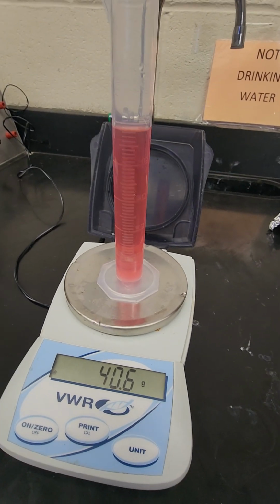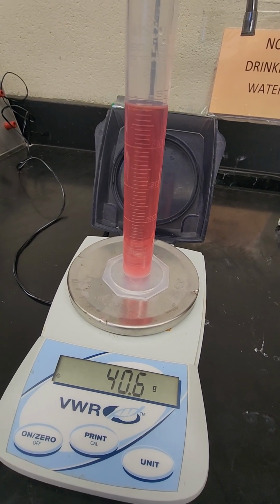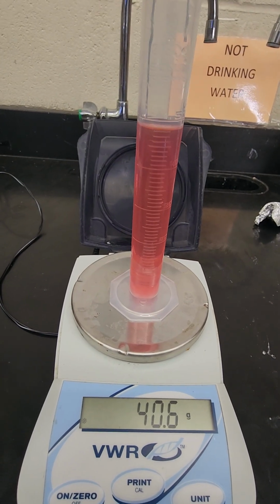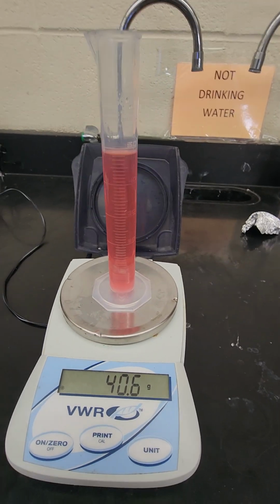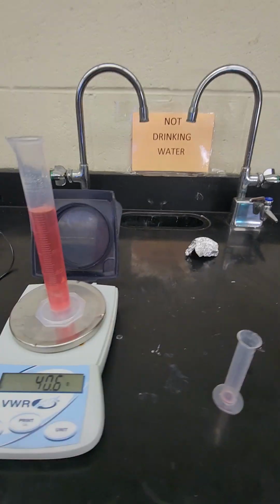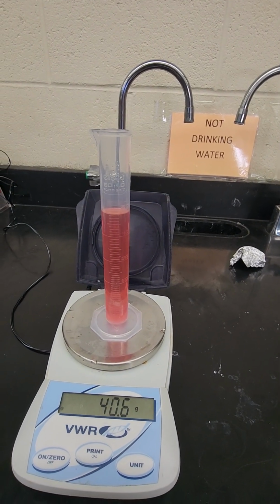It now says to calculate the density, and density based on our notes is mass divided by volume. So for each one, you want to divide to get what you need. I'm going to repeat the steps for the blue and the green, and I'll be back in just a moment. Pause the video so you can calculate your densities.